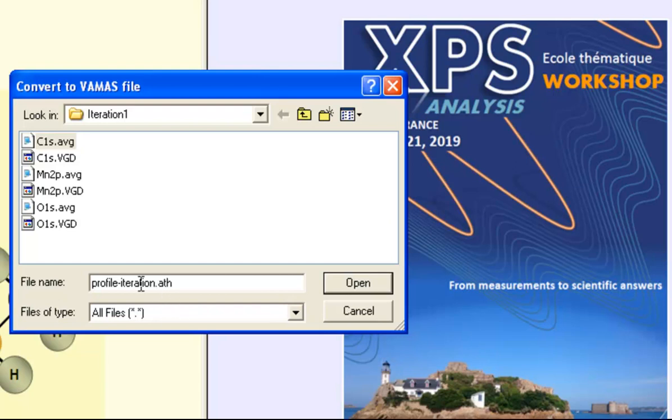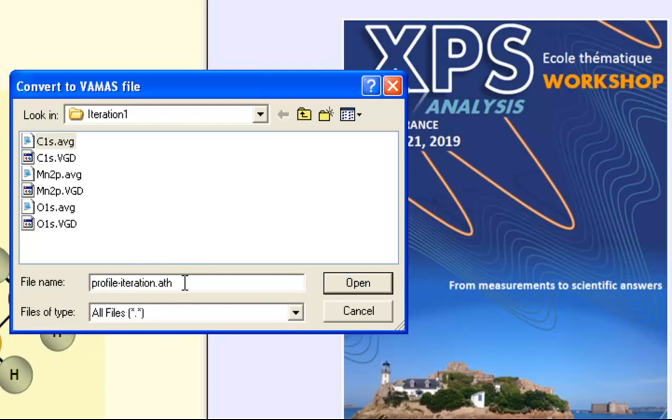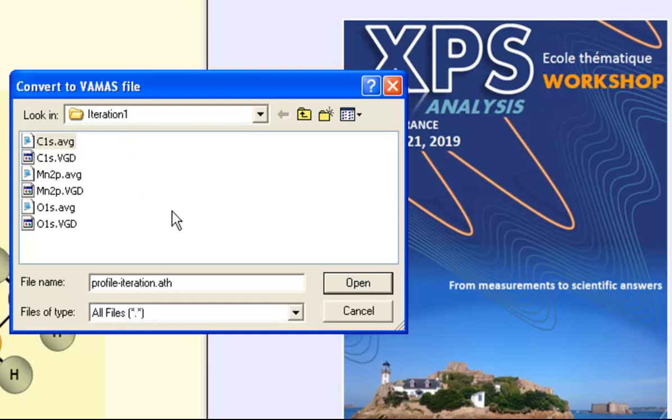Now the first part is just any name we choose, but the dot ATH will read the Avantage Thermo data files that make use of these iterations and multiple detectors. And a new VAMAS file will be created in this directory that will be constructed from each of the AVG files.